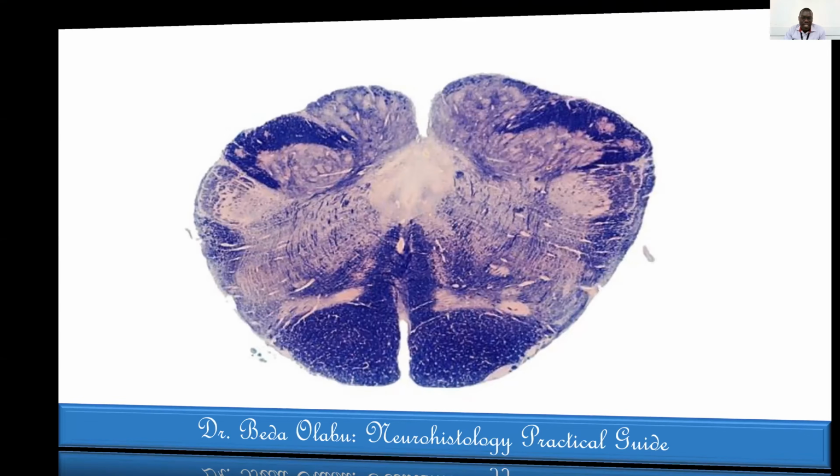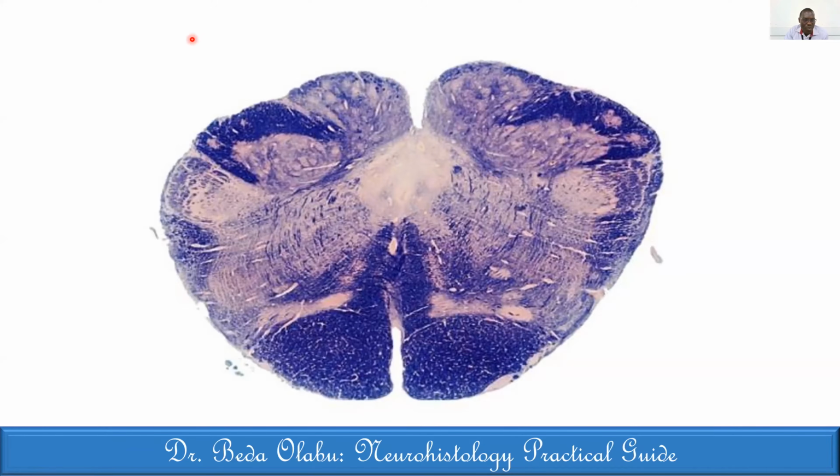All right, this is another slide of the CNS. Any attempt for this? All right, Dr. Mukaya.